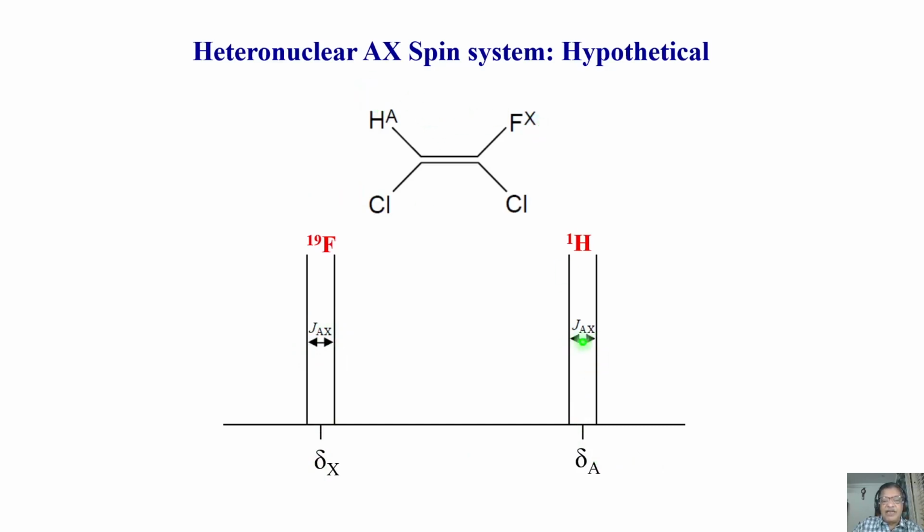In the same way you get this J coupling information, you can also get it from the proton spectrum. Don't think that I got both fluorine and proton spectra in one. There should be a break in this. This is in the proton resonance. This is in the fluorine resonance. It is not in the same single spectrum. So if I give the break here like this, then you will understand. I should clearly write this is a proton resonance. This is a fluorine resonance. Two different spectra. They are not the same spectrum.